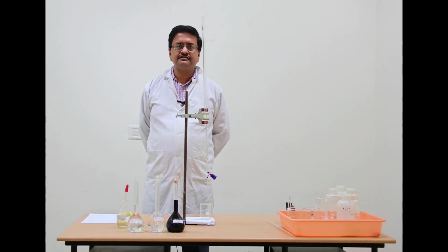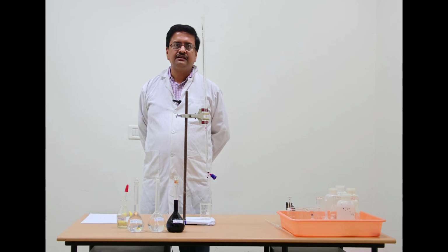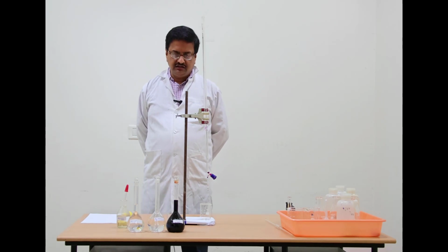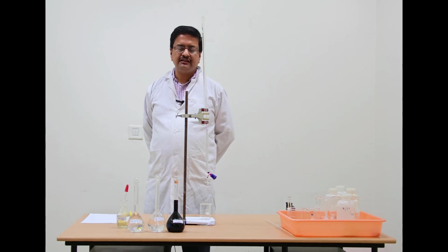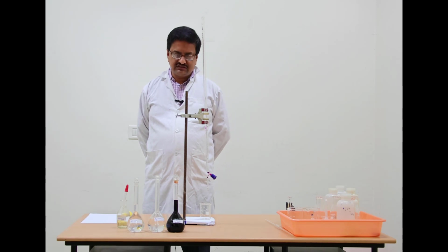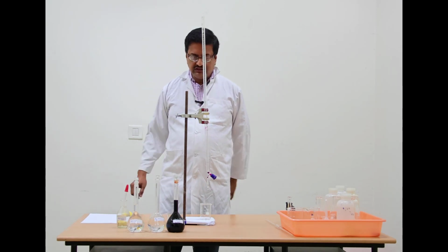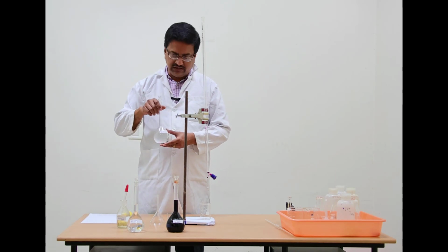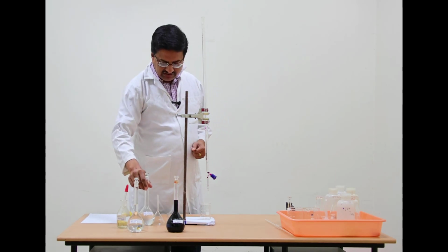Welcome students to this demonstration of titration of potassium permanganate by oxalic acid. This experiment we have discussed in the lecture a few minutes ago, and I am going to demonstrate this experiment here with the standard oxalic acid solution that was provided by the lab assistant.